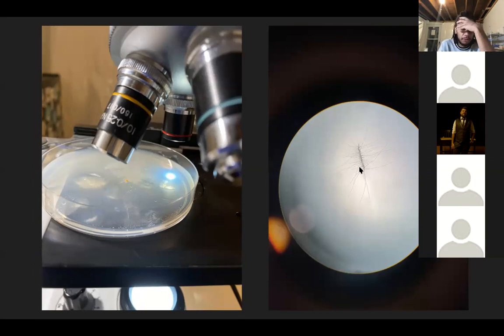It's easier to see the spores if you take the fruit body out and then close the lid on the petri dish, wrap it up with parafilm, and then leave it for another day, and the spores will germinate. Then it's easier to see them in the microscope because there'll be a little bit of mycelium coming off of them. So search around your petri dish and try and find one that is really far away from the other spores, and the mycelium's not connected to anything else.